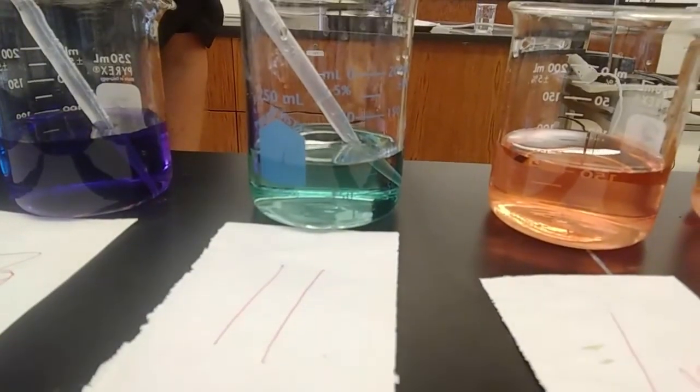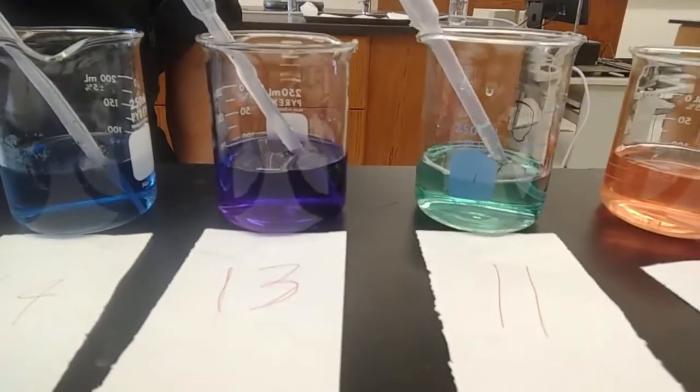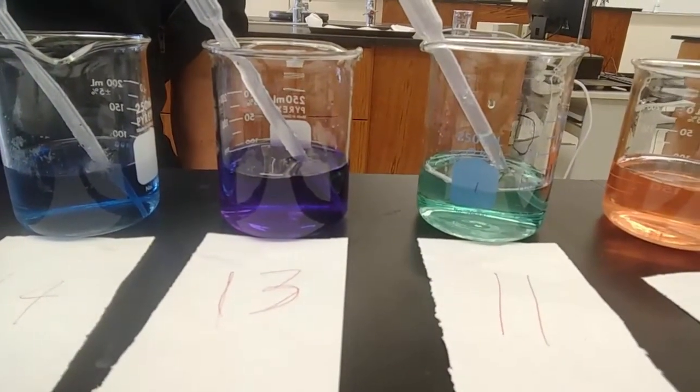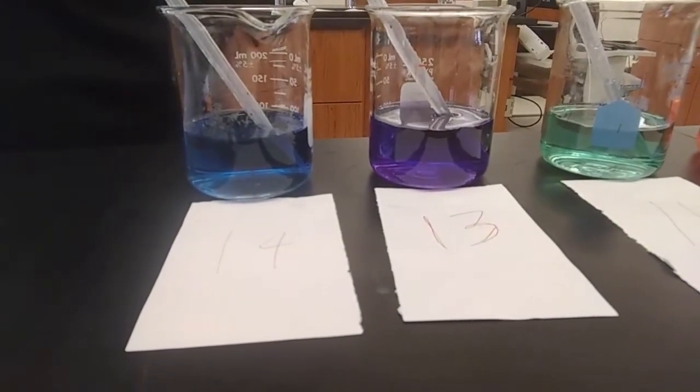Now we have a base color, sort of a greenish blue. 13, deep purple, nice band. And 14, a dark navy blue.